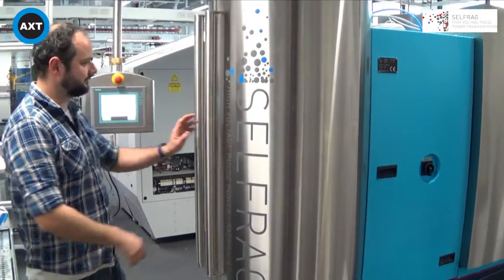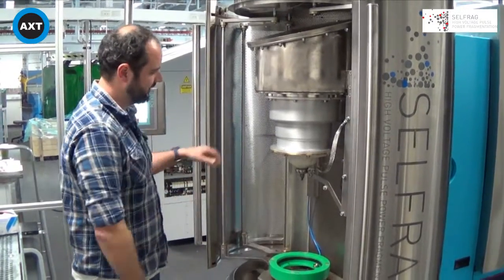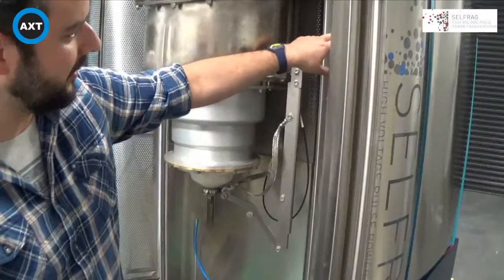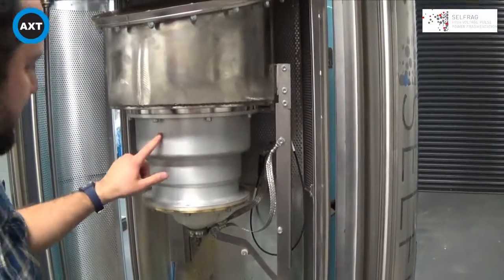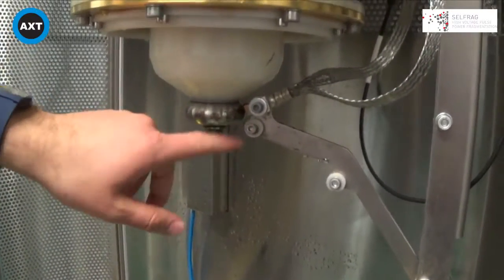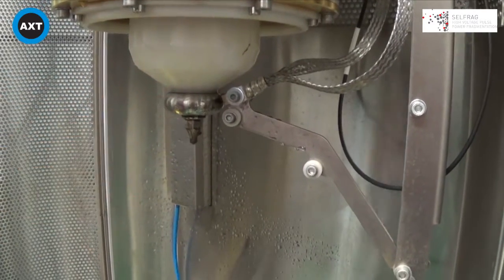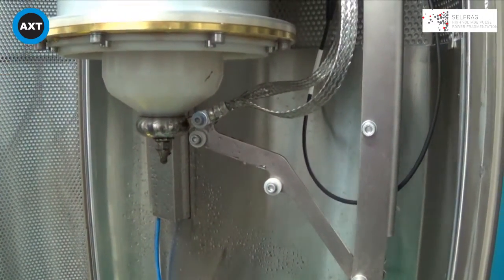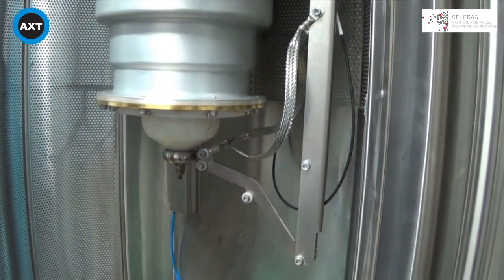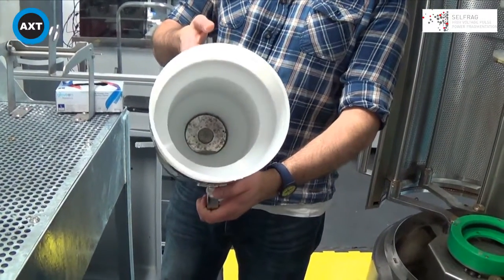Looking inside the process chamber, the doors open as so. The charge is generated, builds up in the generator, and is discharged through this electrode here. We have a custom grounding hammer which is always in contact with the electrode — another safety measure. When we turn the machine on, a discharge is generated. It comes from the electrode to impact the counter-electrode which sits at the bottom of the process vessel.